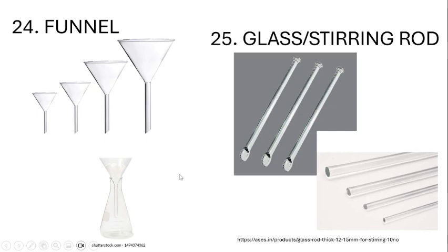Okay? Next, we have your glass or your stirring rod. So it is used to mix liquids or solids in a container, usually in a beaker. So do not confuse stirring rod with thermometer. Okay?